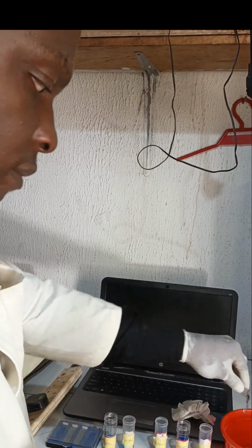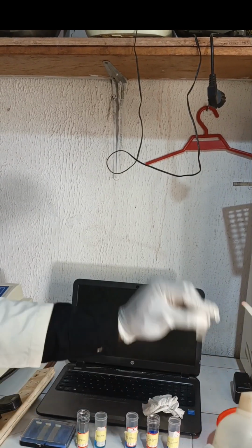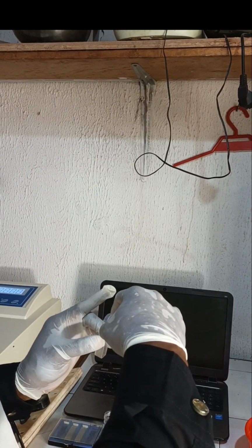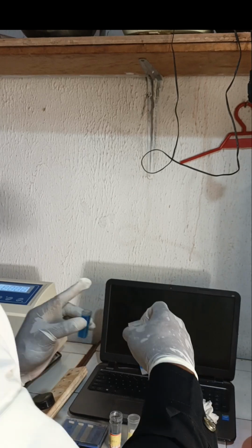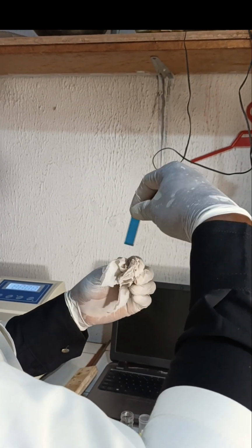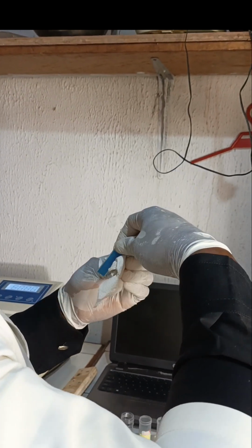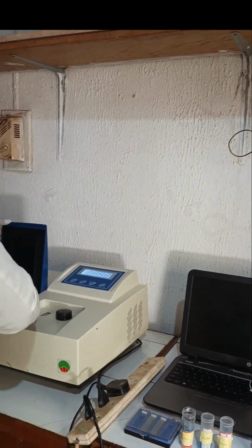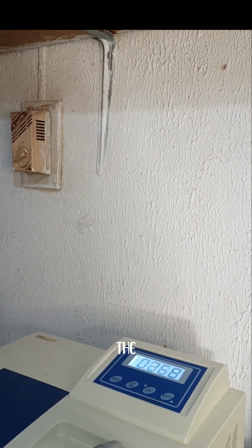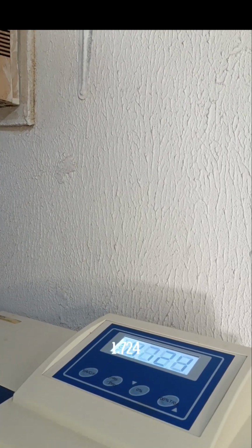We clean the cuvette. Okay, so we take the absorbance of 15 parts per million, and they give us 1.724.